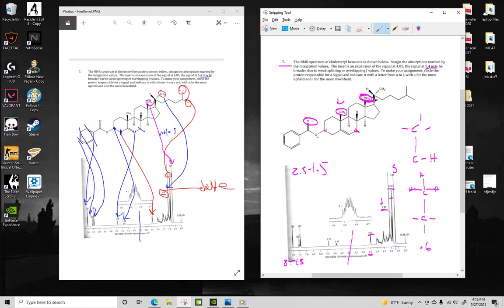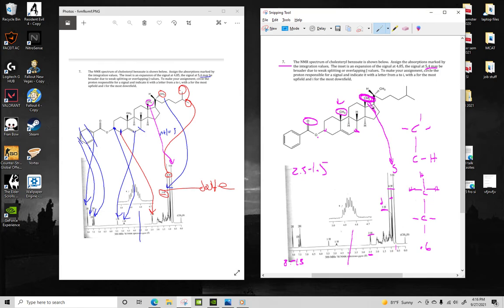I would argue it's these methyl protons over these ones. So I'd say it's these ones, and I'd argue that because these ones are more in an electron-withdrawing environment, so they would be a little higher than 0.6. There's definitely a lot of wiggle room in this, but I would still say this is the better answer because these protons are going to line up with this upfield peak.